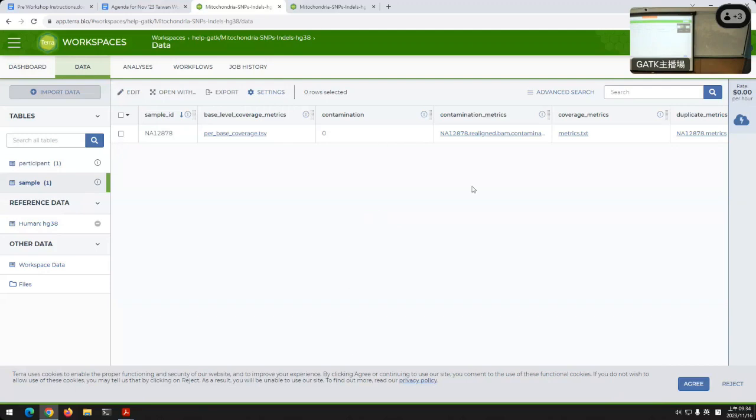And if you haven't played around with Terra workflows very much, the data table shows all the metadata we have associated with there. It's kind of a wide table here, but that's okay. If you want to see what's there, you can actually just click on settings here, okay?